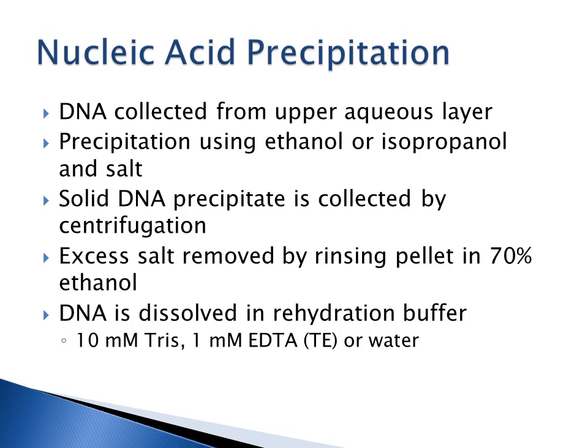So usually in the lab, the buffer that's used is called TE, and TE is a mixture of 10 millimolar tris and 1 millimolar EDTA. You can also dissolve your DNA in water. However, water might contain some DNases or enzymes that could degrade your DNA. So a nice buffered solution like TE is commonly used. You can also just use tris without the EDTA because EDTA can inhibit some PCR reactions.